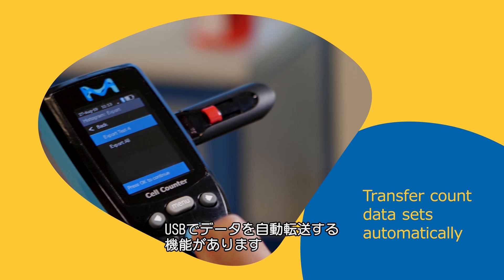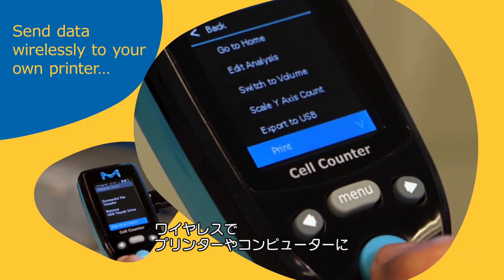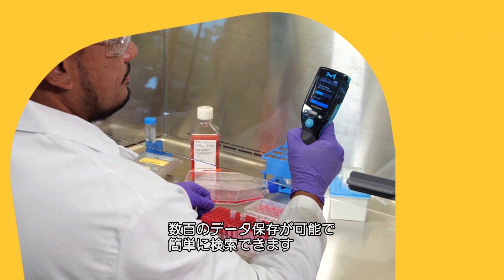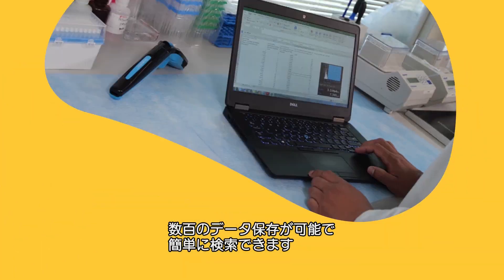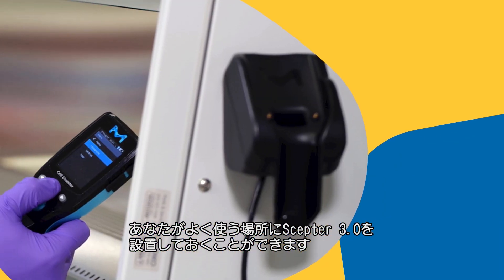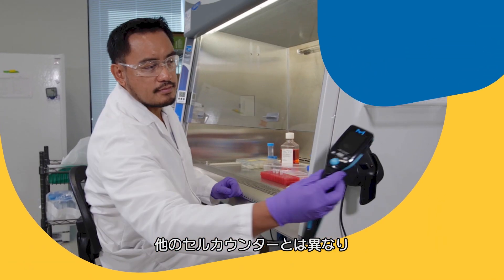The Scepter 3.0 counter provides the option of automated data transfer by USB drive or via wireless transmission from the counter to the user's printer or computer workstation. The instrument stores hundreds of results for easy retrieval of archival data, and the charging station can be mounted anywhere so the Scepter 3.0 counter is always ready to count when you are.